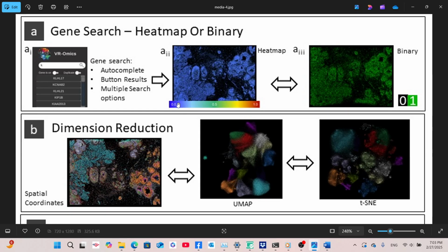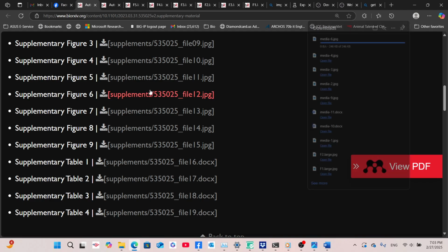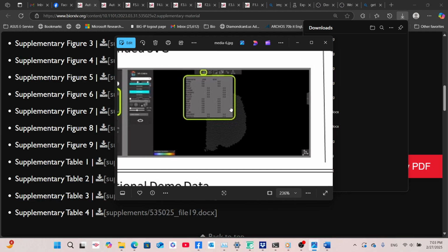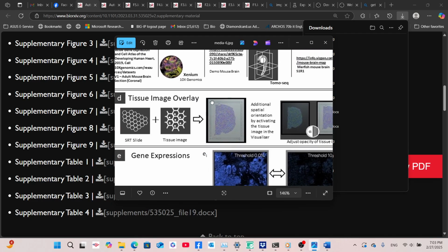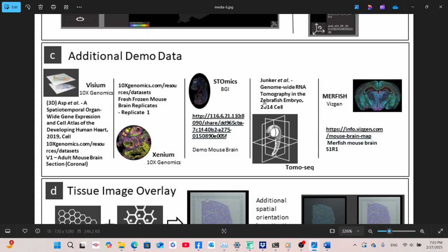Supplementary Figure 6e. If SVGs were identified using the AW, these genes are highlighted with a turquoise-colored result button for easy identification. Supplementary Figure 6b. Superimposition of other metadata, such as H&E staining or clustering results from Leiden or spatial clusters calculated in the AW, is facilitated for enhanced data interpretation. Supplementary Figure 6d. When available, serial sections across a sample enable the uploading of a 3D model to improve spatial and anatomical orientation. Supplementary Figure 4c. With various adjustments available to align the 3D model with the dataset.